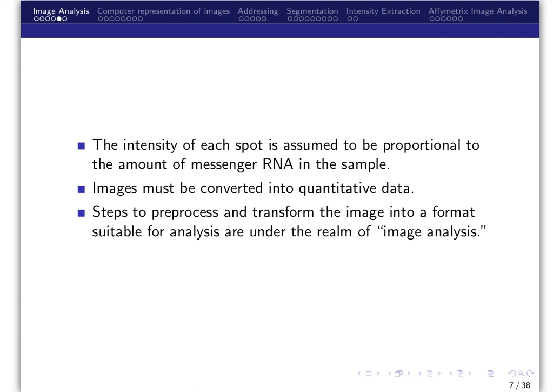Therefore, images must be converted into quantitative data so that we can analyze the microarray data statistically. The steps for pre-processing and transforming an image into a format suitable for statistical analysis is called image analysis.